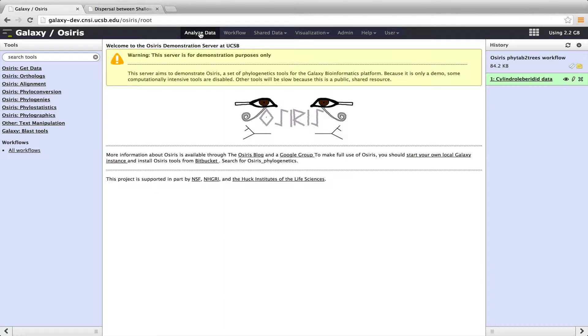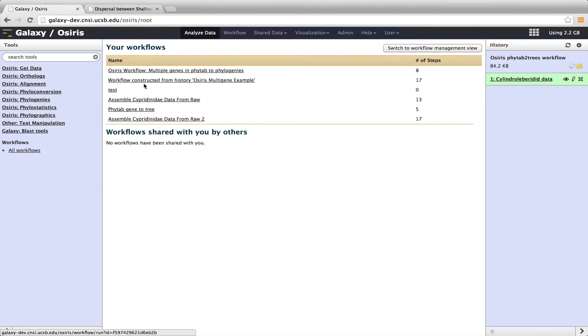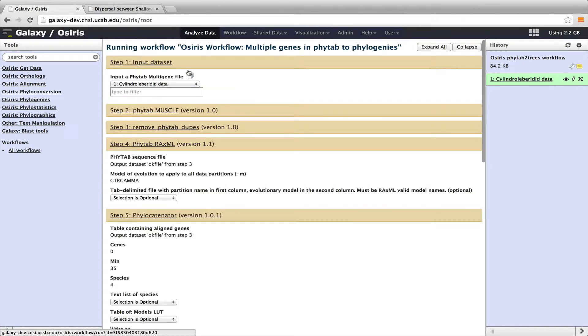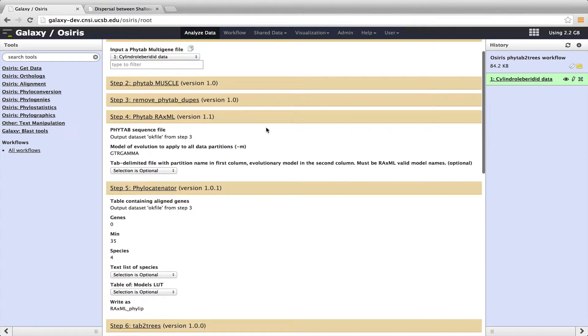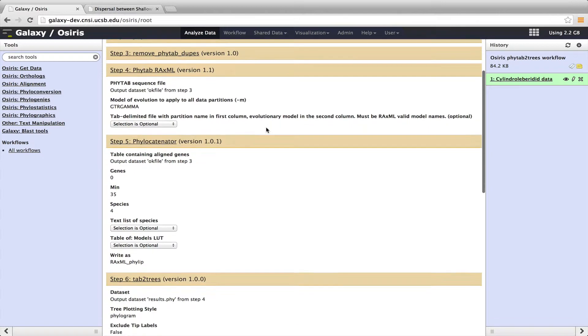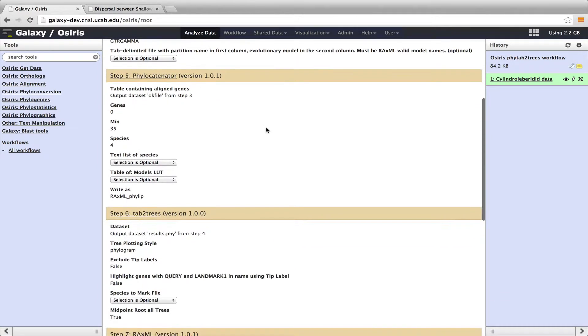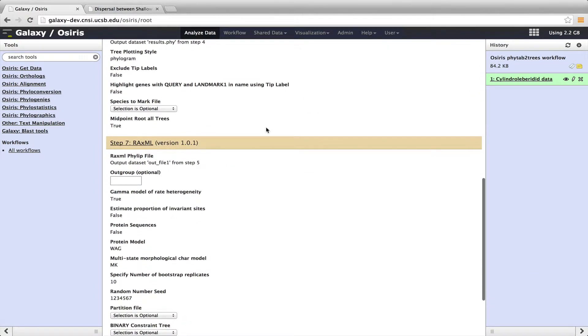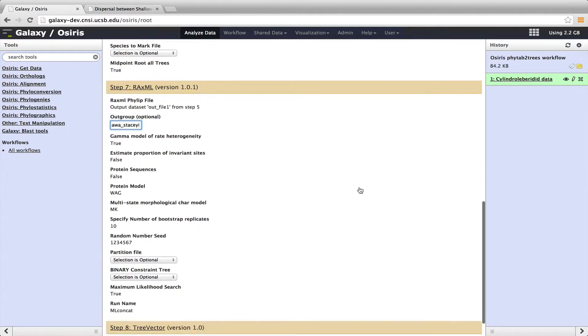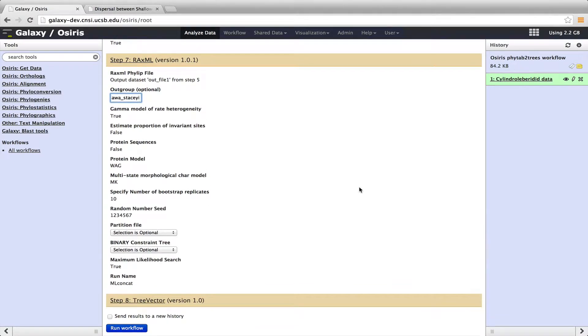I'll go back to Analyze Data, and we have our history here with our data set in the history. So I will click on Workflows here, and now I want to choose this one, OSIRIS Workflow Multiple Genes in PHYTAB to Phylogenies. That's the workflow I just showed you. And here's our data set that we need, which is a PHYTAB multi-gene file. That's what it's asking for, and all these different tools that I showed you. And here I have allowed the outgroup to be specified for the RaxML run. In this case, it's a species called Manawa staci, which I will put in there. And then we can click Run Workflow.